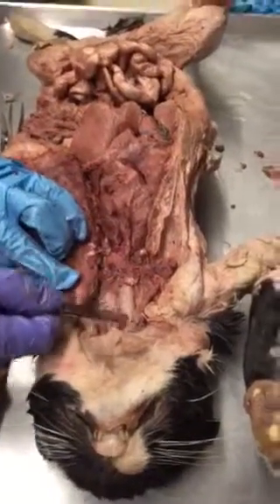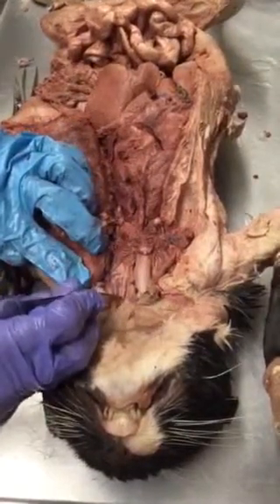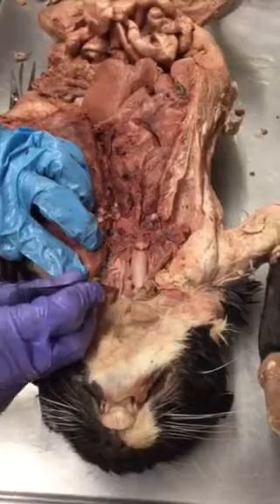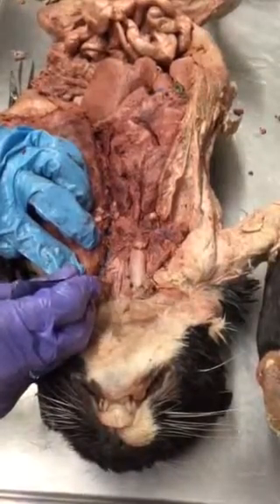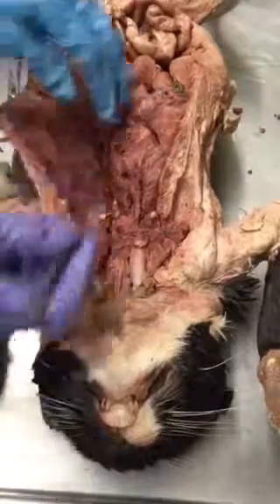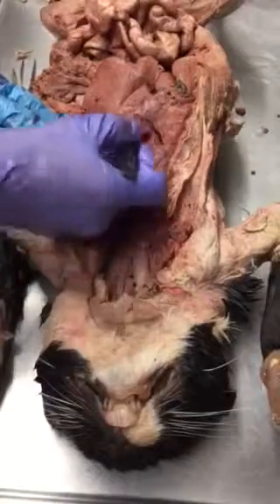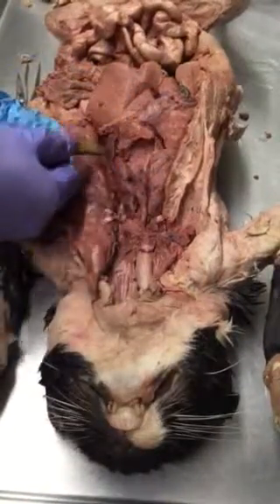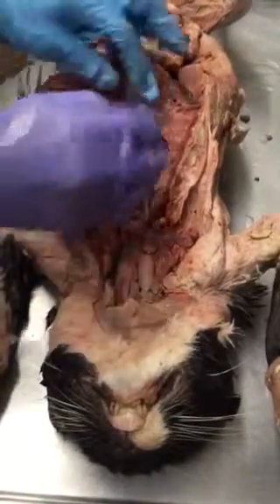What's this tube? Trachea. Underneath it is the esophagus. What's this pink tube? The carotid artery. What's the white structure next to it? Vagus nerve. What's the blue next to it? Jugular vein. Moving down, what's this layer? The pericardial sac. What's this organ here? The lungs. What's inside the pericardial sac? The heart.